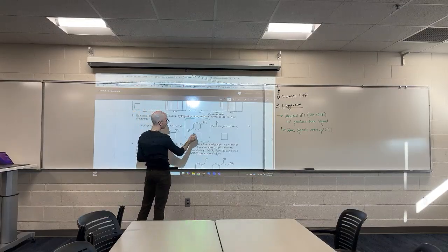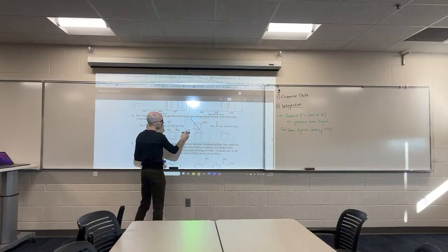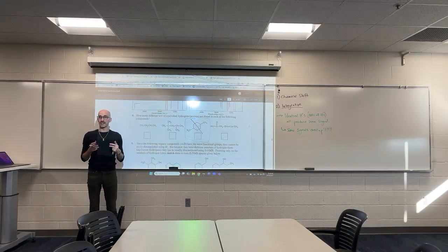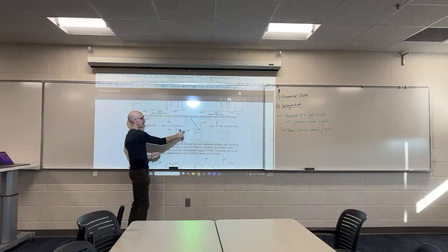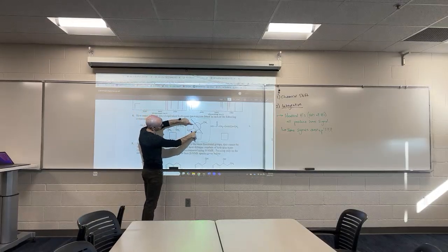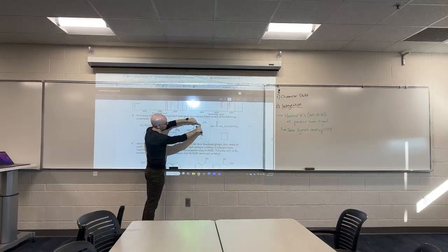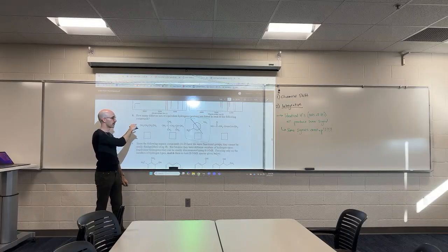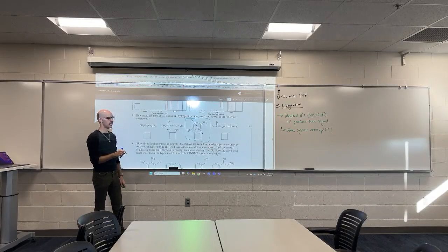We should show a plane of symmetry that reflects them onto each other. And I can see a plane of symmetry there, so they are identical. We can also describe it. A methyl attached to a tertiary carbon attached to secondary, secondary, tertiary. Methyl attached to tertiary, secondary, secondary, tertiary. Identical. Okay, so the methyl groups are one signal.